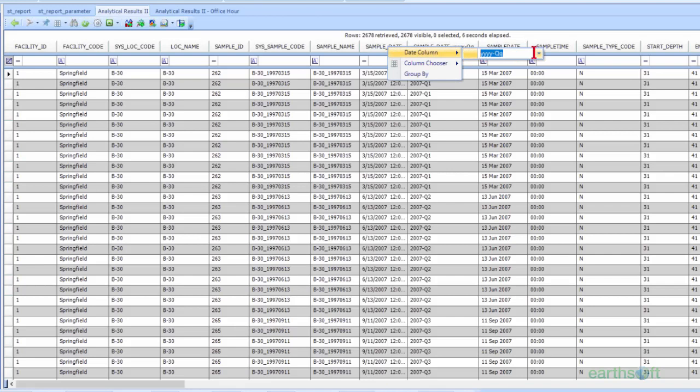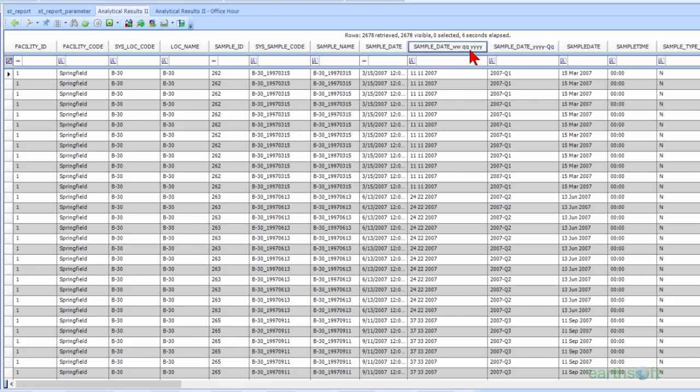But let's say, for example, I want to do something crazy. I want to free type something. Let's see, maybe I want to go week, quarter, year, for whatever reason. I know that's kind of unusual, but why not? And then I hit enter. You'll see that we get week, quarter, year. Oh, that's maybe not the best one. In this case, I should have done a capital Q, so it doesn't know what to do with that. So it just repeated that week information.